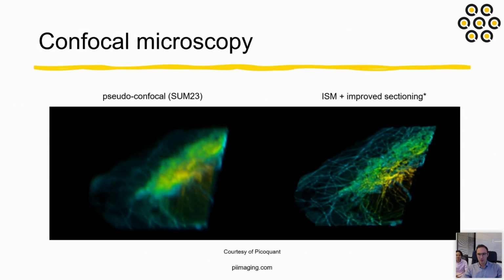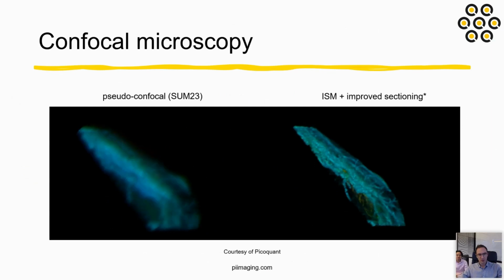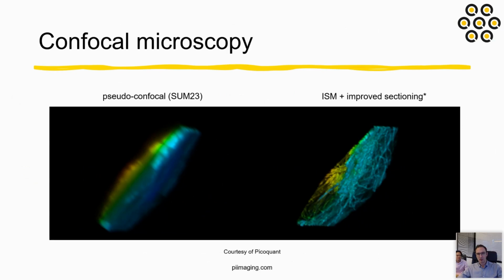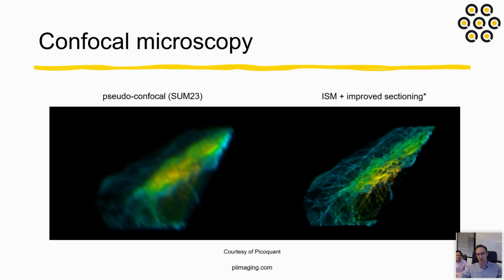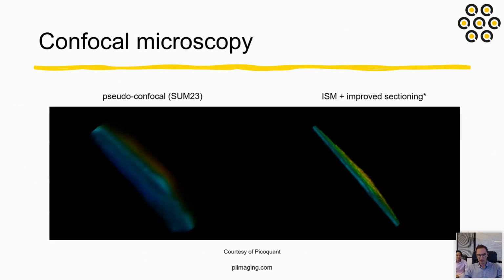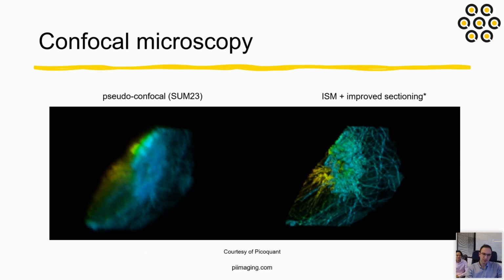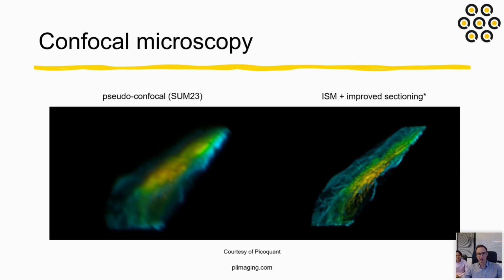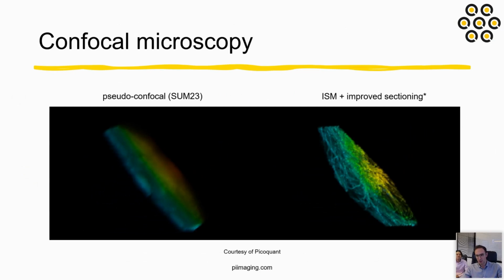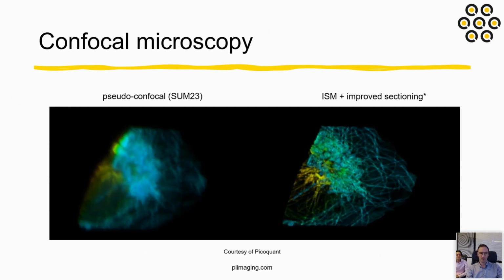Now we are switching to confocal microscopy in conjunction with the signal-to-noise ratio and, of course, the dynamic range. SPAD arrays allow you to have super resolution imaging. And here I would like to emphasize the great work of our friends from PicoQuant as well, showing the difference between just normal confocal imaging and then confocal imaging enabled by SPAD arrays, improving the resolution by a factor of approximately 2.